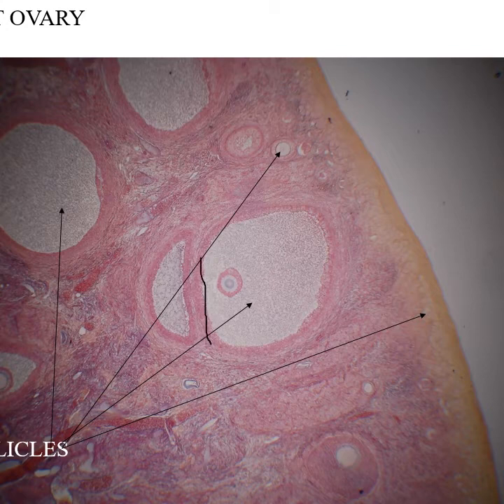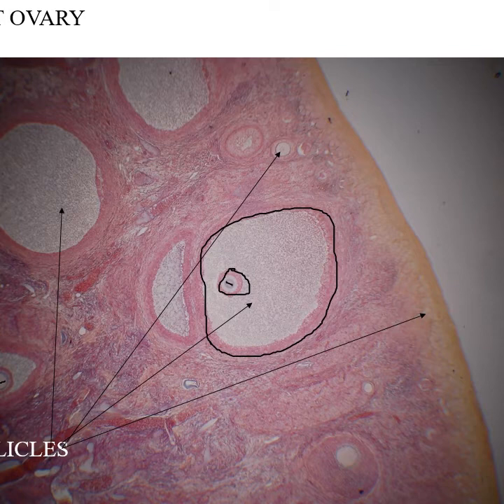There are these large structures in here. These are also called follicles. Of course, they're fluid-filled sort of balls, but they're not the same as a thyroid follicle. They just are fluid-filled structures. These contain an oocyte. So the ovarian follicles, that little thing right there, is an egg or oocyte. There's another one over there to your left, one down at the bottom, one at the far left.